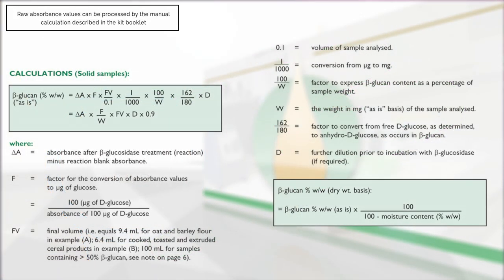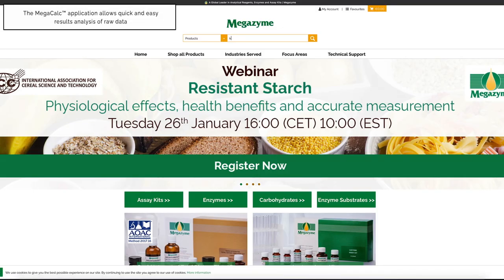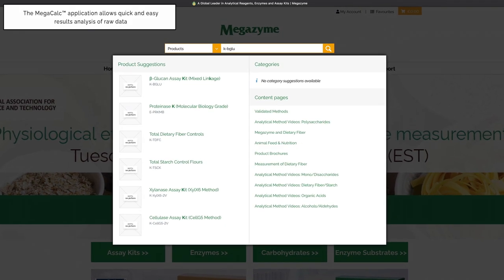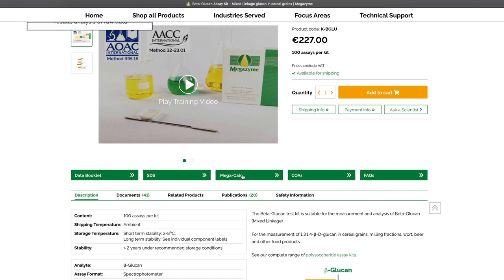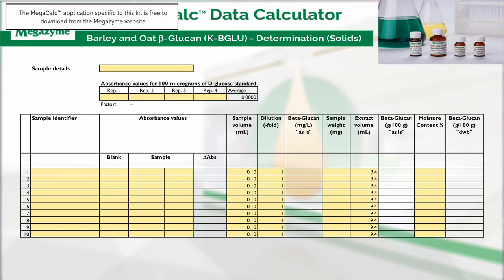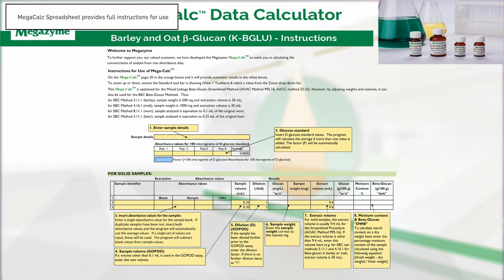In absorbance mode, the results output are raw absorbance values for both blank and samples. Therefore, the calculation of beta-glucan content can be performed manually, as described in the calculations section of the kit booklet. Megazyme has also developed specific Excel-based Megaquant applications for each Megazyme kit to allow quick and easy results analysis. Results can be analyzed using the Megaquant application specific to this beta-glucan assay kit, which is available to download free of charge from the Megazyme website. The Megaquant spreadsheet provides full instructions for use.